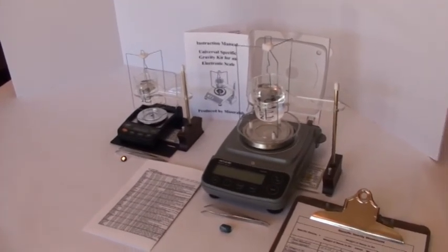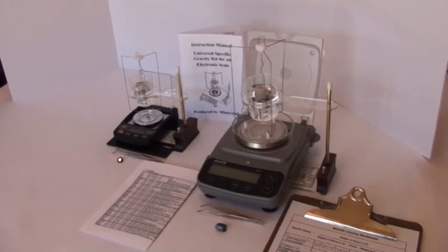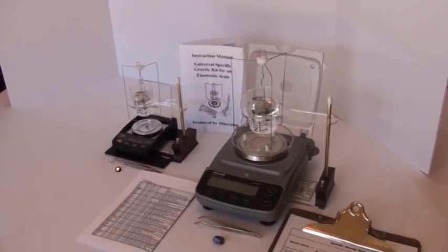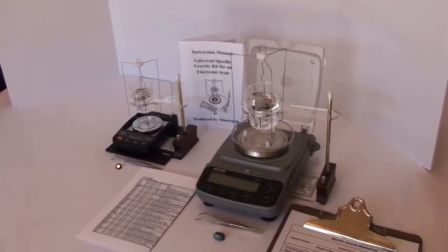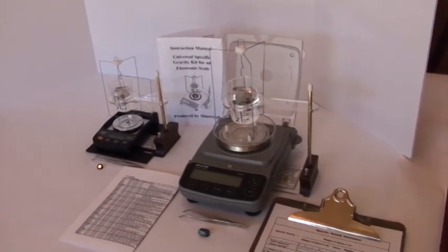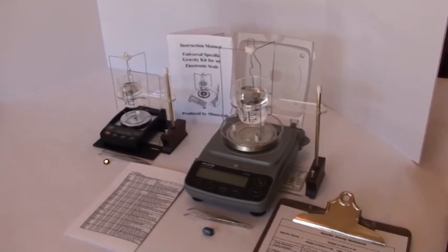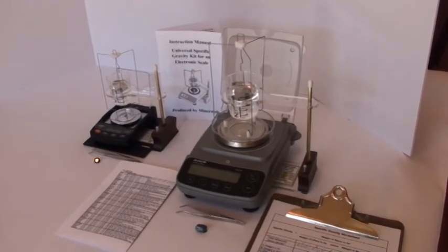Now why did we measure specific gravity? Well, in the case of gems and minerals, it's an important and powerful identifying property. And in the case of industry, we often need to know the density of materials that we're manufacturing or working with.